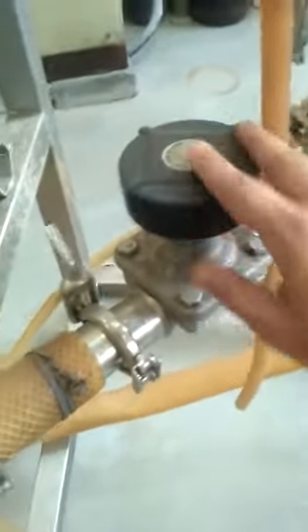Here we can see the retentate flow rate can be controlled by using this valve. The retentate will be coming out via this pipeline here.